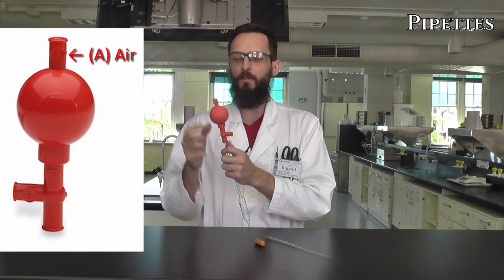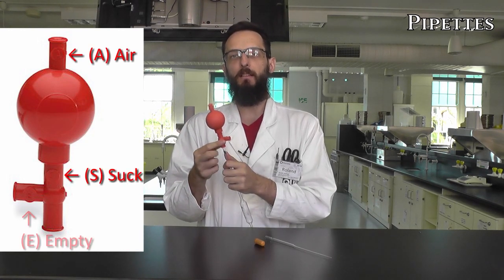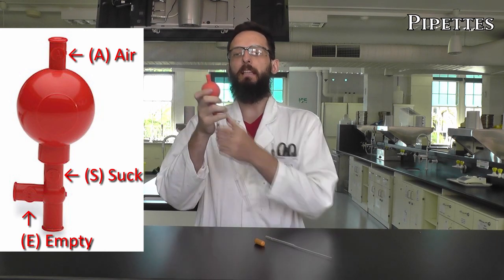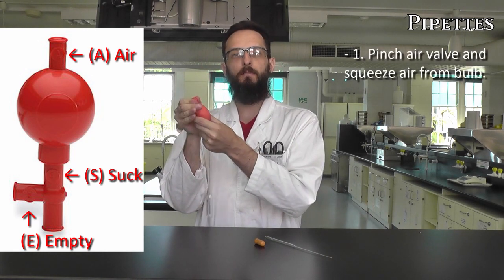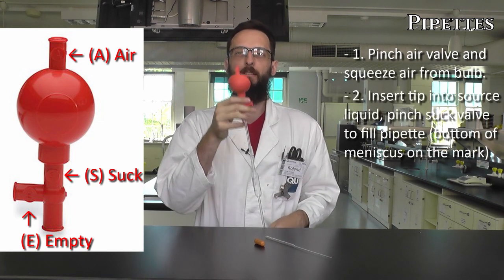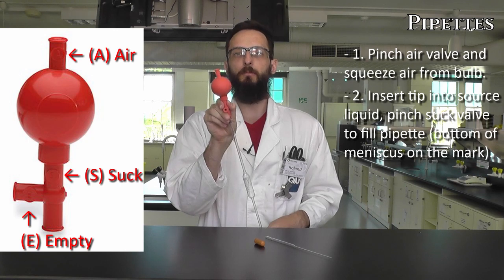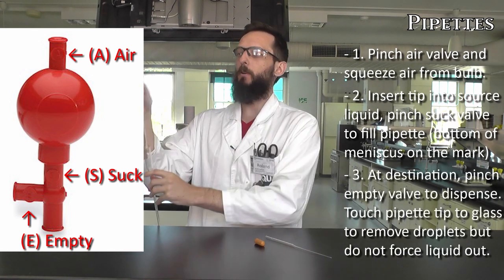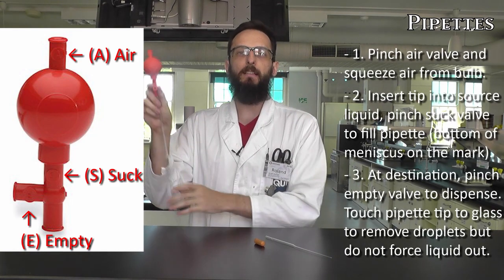This pipette bulb has three valves, the one at the top is marked air, the one in the middle is marked suck, and the one at the bottom is marked empty. So similarly to the other pipette bulb, I would simply hit the air valve, squeeze air out, put the tip into my source liquid, hit the S for suck, you see the bulb refills, and it would suck liquid up to this mark, then we transfer over and we hold the empty valve to empty at our destination.